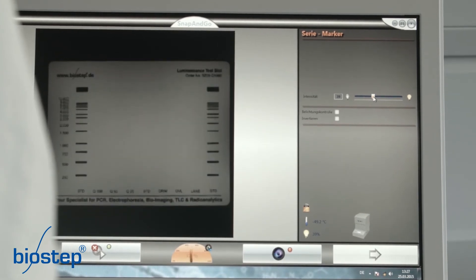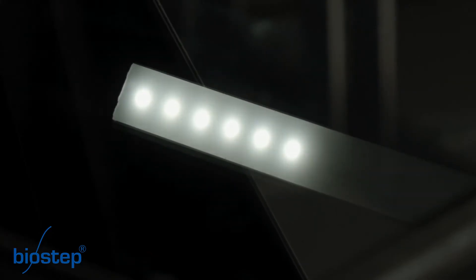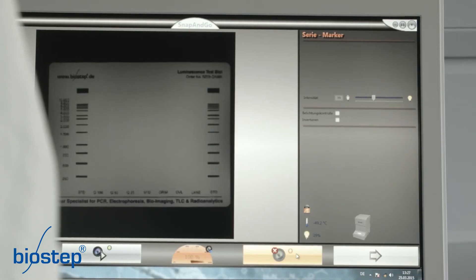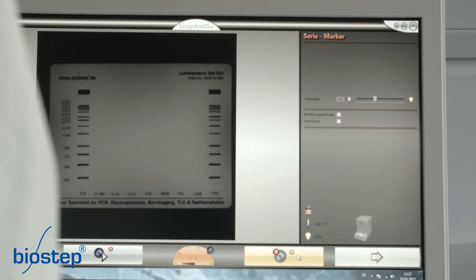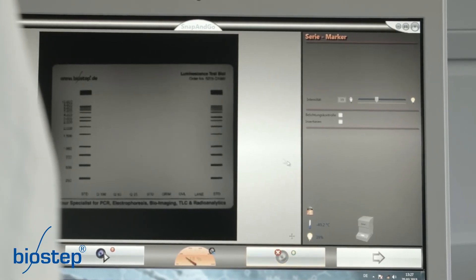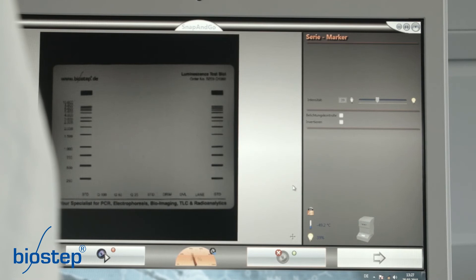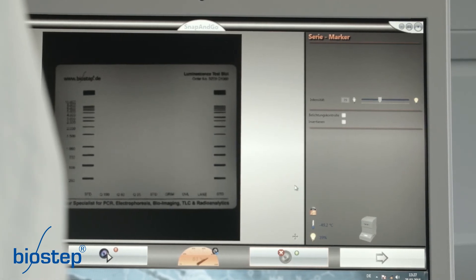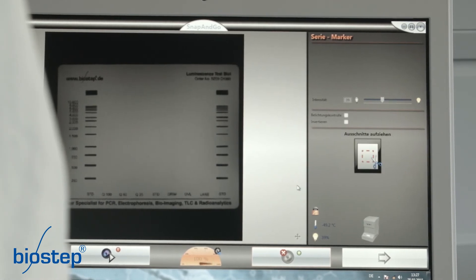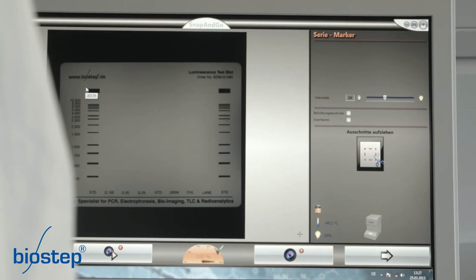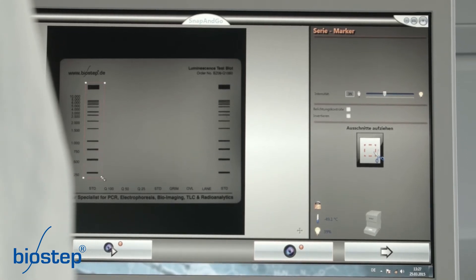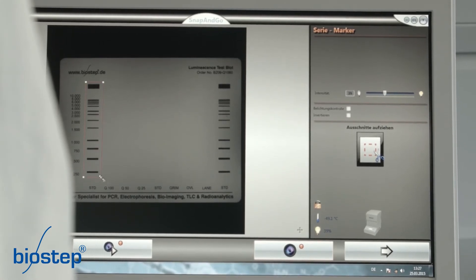Click on continue to capture the colorimetrically stained marker proteins. LEDs are switched on and the live image appears. The intensity of the LEDs can be set. Click on capture for recording an image. You can now draw a frame around the markers with the mouse cursor and cut them out by clicking on continue.